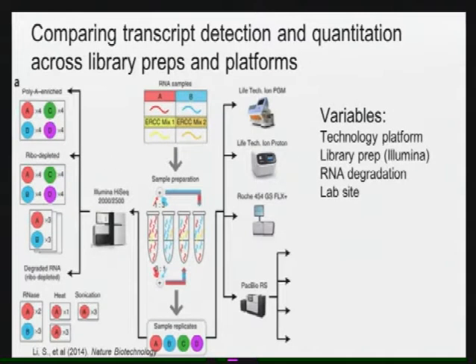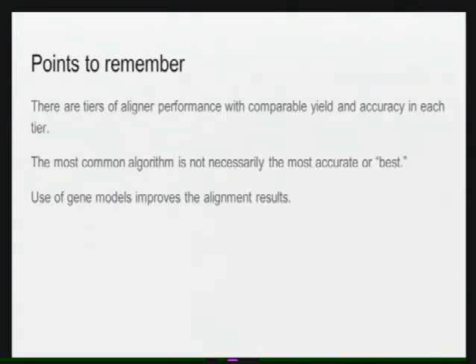I don't know if you're going to go into this. But how do you evaluate that when you're analyzing a data set for the first time? Which workflows are you going to use, and do you use one or do you use multiple? What aligner am I going to use to work with my data? Right.